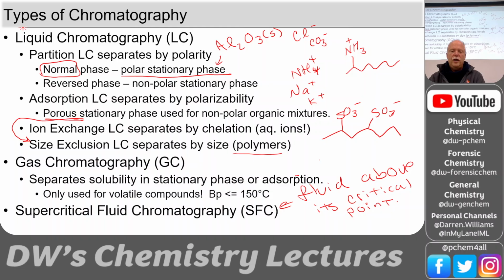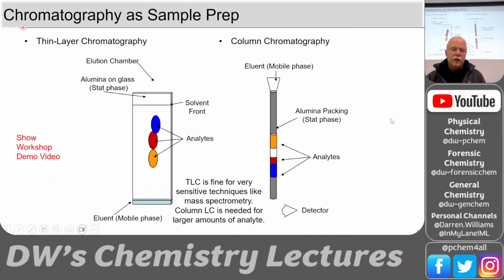If you don't know what the critical point is, you've got to take thermodynamics, 4449. It's essentially a fluid that has the mobility of a gas, but the density of a liquid, so it can fill the container. If this room was filled with a supercritical fluid, it wouldn't have a meniscus. It would fill the whole container, but yet it would have the density of a liquid. So high pressure gas, if you want to think of it.